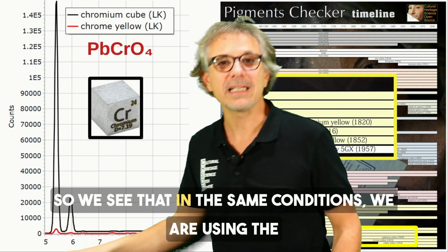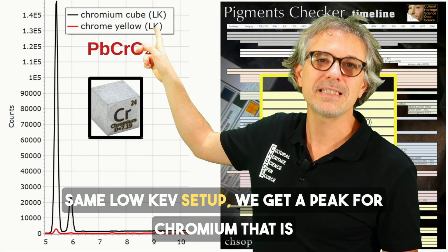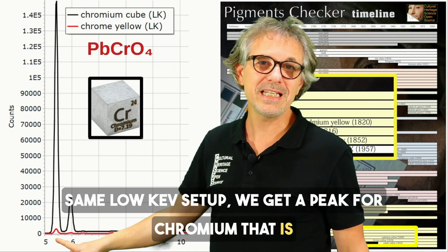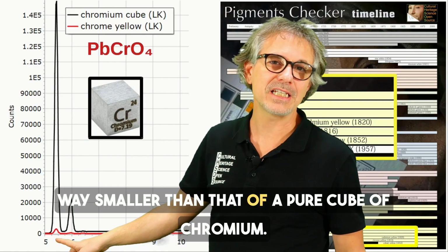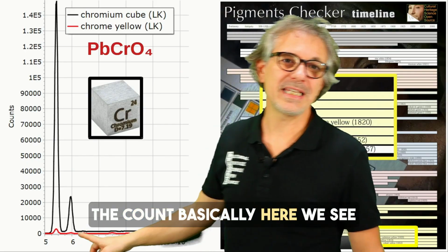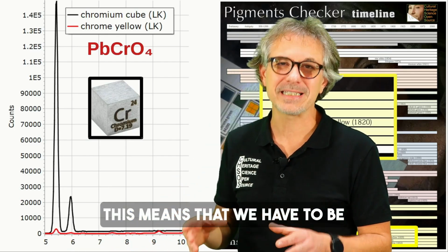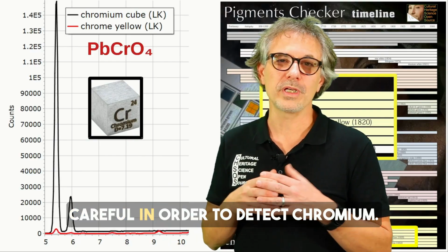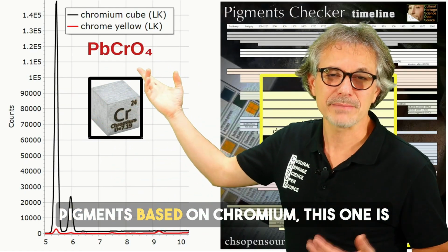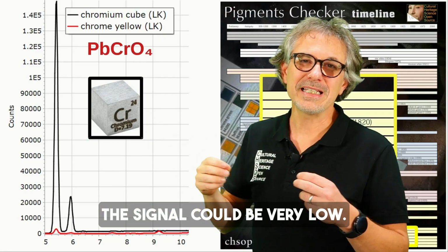So we see that in the same conditions, using the same low keV setup, we get a peak for chromium that is way smaller than that of a pure cube of chrome. The count here will be around 2000 counts. This means that we have to be careful in order to detect chromium, because with these pigments based on chromium, this one being the most used, the chrome yellow, the signal could be very low.